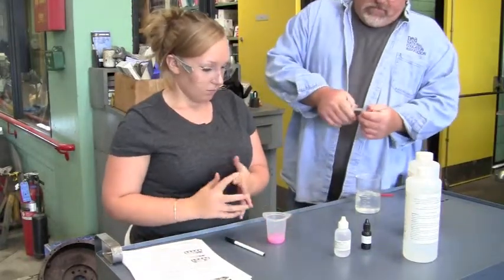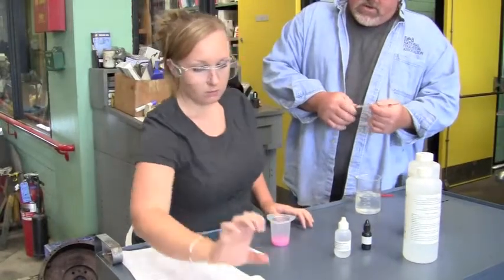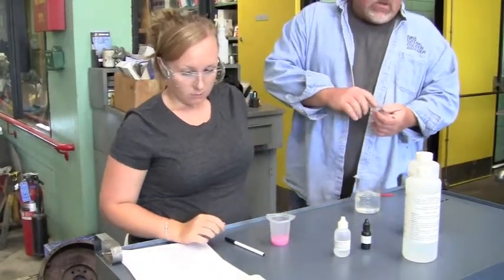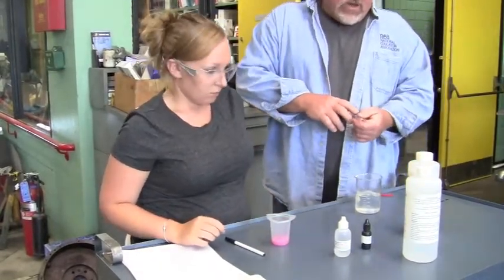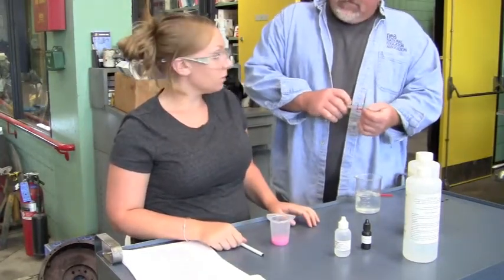So it took 8 milliliters. So we're going to use 8 grams of sodium hydroxide per liter of oil.